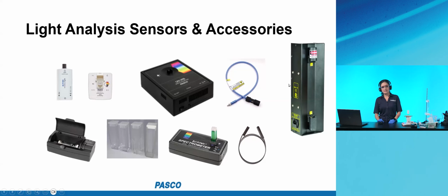that you can use to analyze, for example, a gas hydrogen tube, to see what the specific line emission spectra are for whatever gas sample that you have. The spectrometers come with a sample cuvette appropriate for whatever instrument that you purchased. You could also get the accessory quartz cuvettes for the UV-vis spectrometer for those shorter wavelength samples. And also here's the polarimeter, where you can look for the interaction between particles and light rotation if you have a substance that's able to do that.